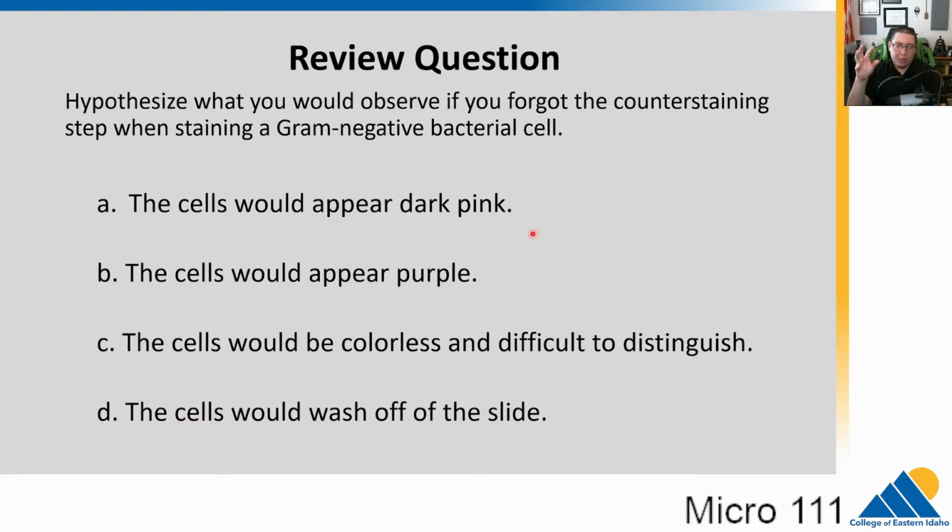So think about what the counterstaining did. If you need to flip back to the procedure, do that and pause the video. Think about that. Okay, the answer would be the cells would be colorless and difficult to distinguish.